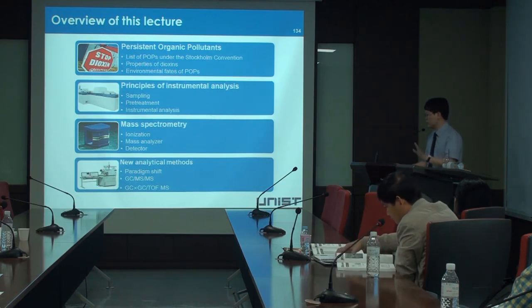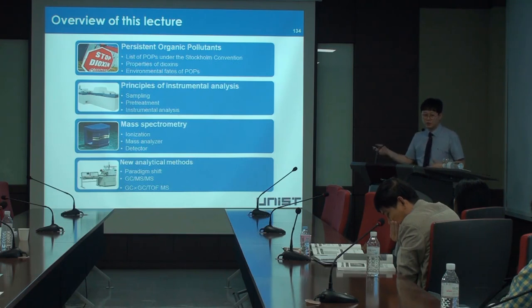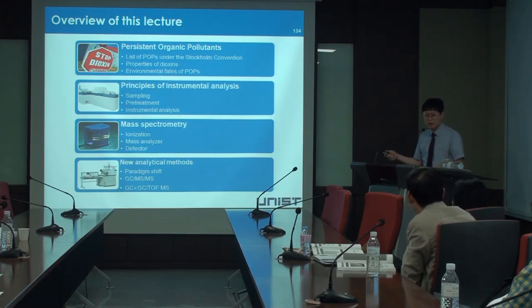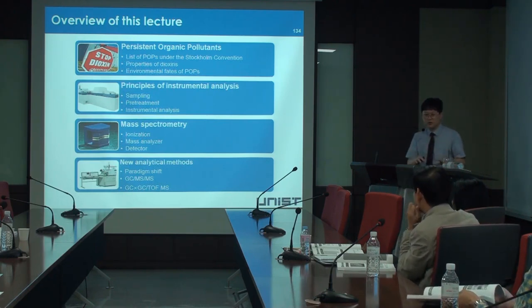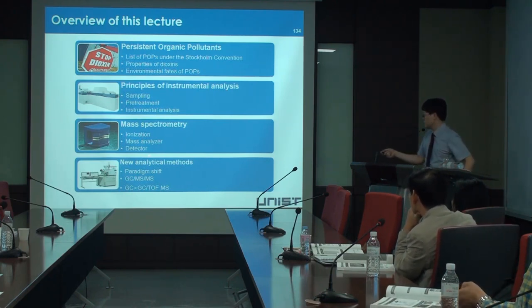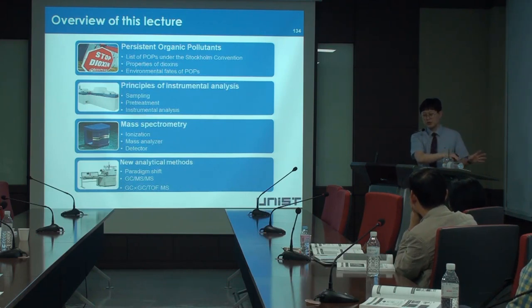The first topic is ionization. The second one is the mass analyzer, mass separation. The third one is the detector. The detector is widely used; we can use the same instrument. But for ionization and mass analyzer, there are many combinations. Lastly, I introduced new analytical methods: a paradigm shift from target analysis into non-target analysis, and also from HRMS into another type of MS such as MS/MS and GC-MS/MS and so on.